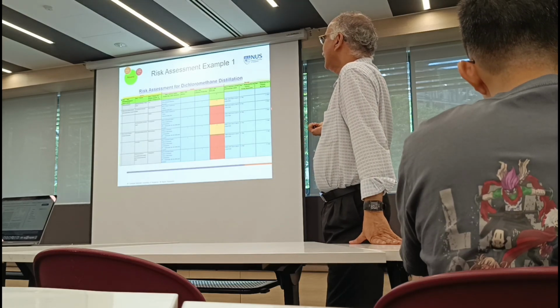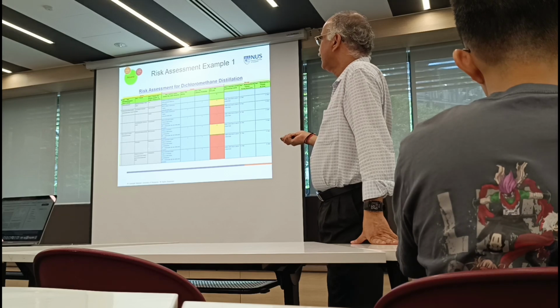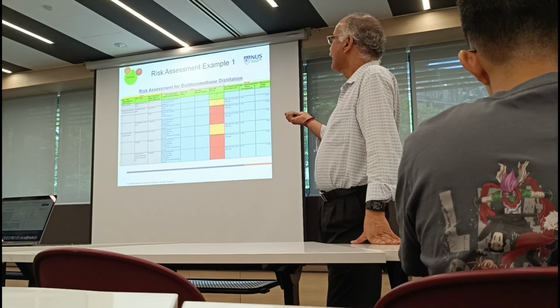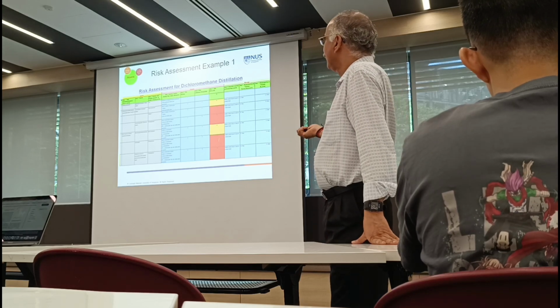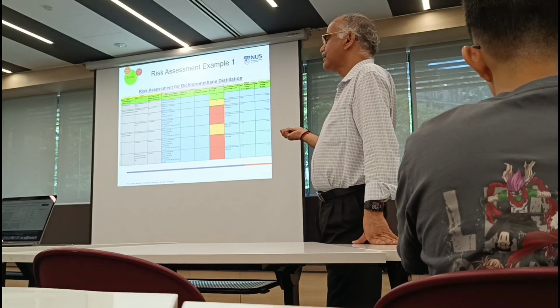Okay, so the entire risk assessment will look something like this, right? These were the ones we were talking about earlier. And then step 2, the control measures we put in, is the 4th column, and then risk severity is the next one, likelihood is another one, and then you do the entire risk level. This is a multiplication of these two.